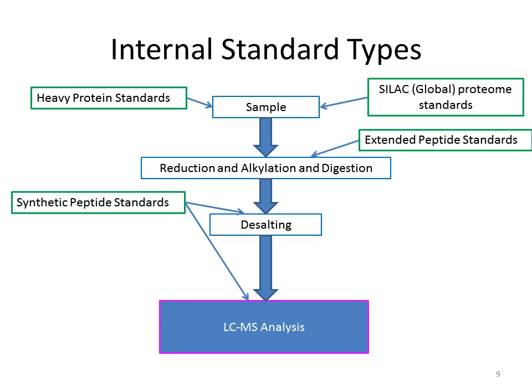So another option for a global proteome standard, and there are a lot of papers, I think, from Dick Smith's lab, where they digest their sample with trypsin and then redigest it with heavy water, O18 water, and that O18 is incorporated into the peptide during the cleavage process, and I think you get a mass shift of 2 or 4, I forget what it is per peptide. And so that's a way to label it.